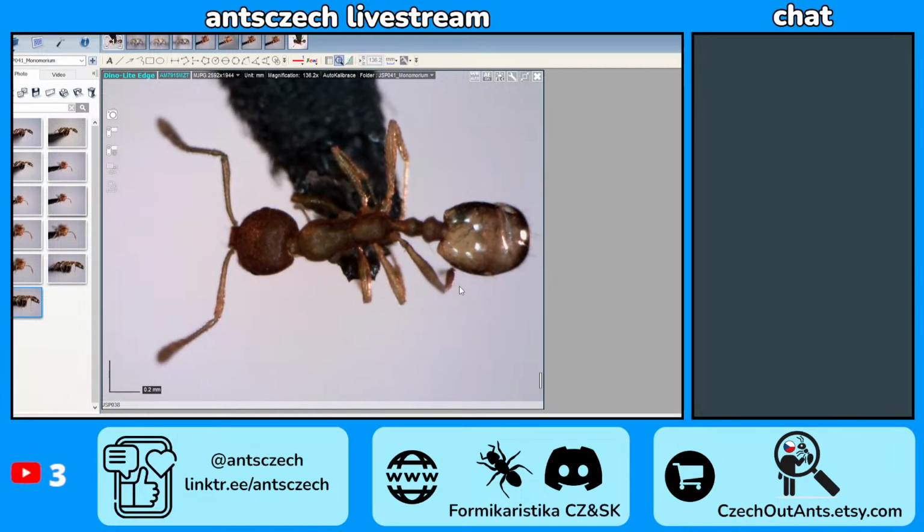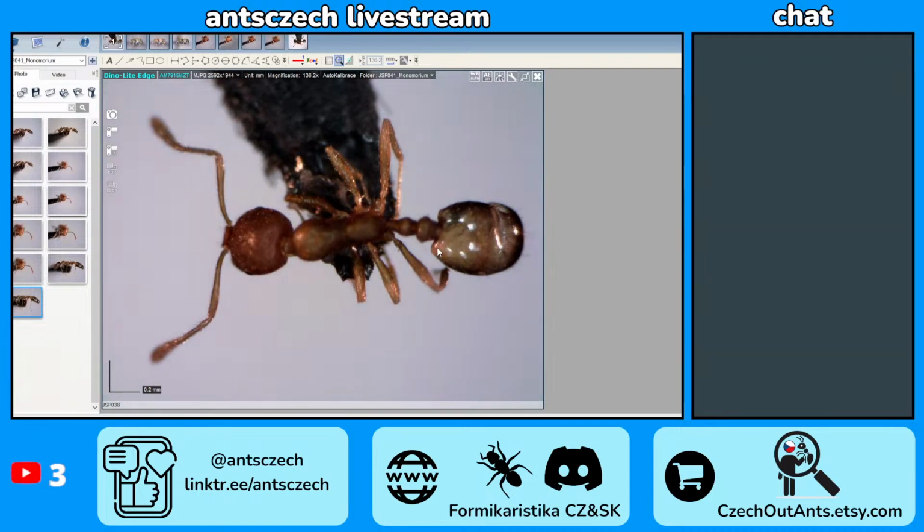At least with the diffuser, the light reflections of the microscope light aren't that visible, because now it's extremely visible on the gaster, and on the legs as well. What can you do?